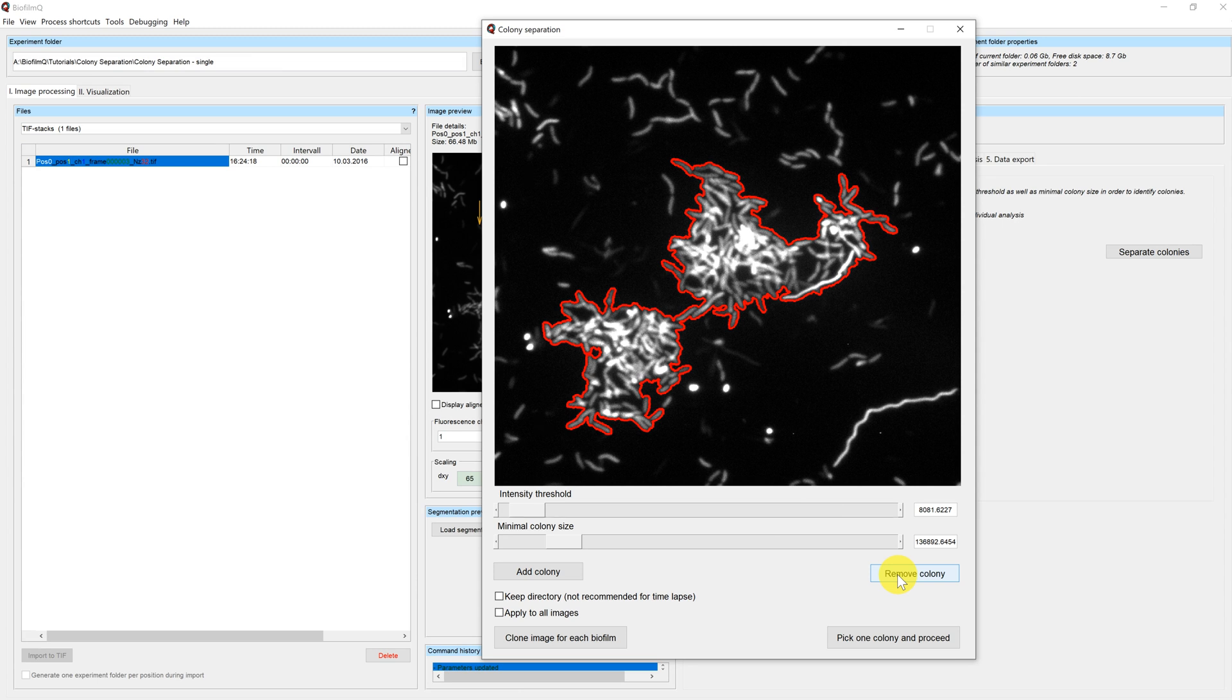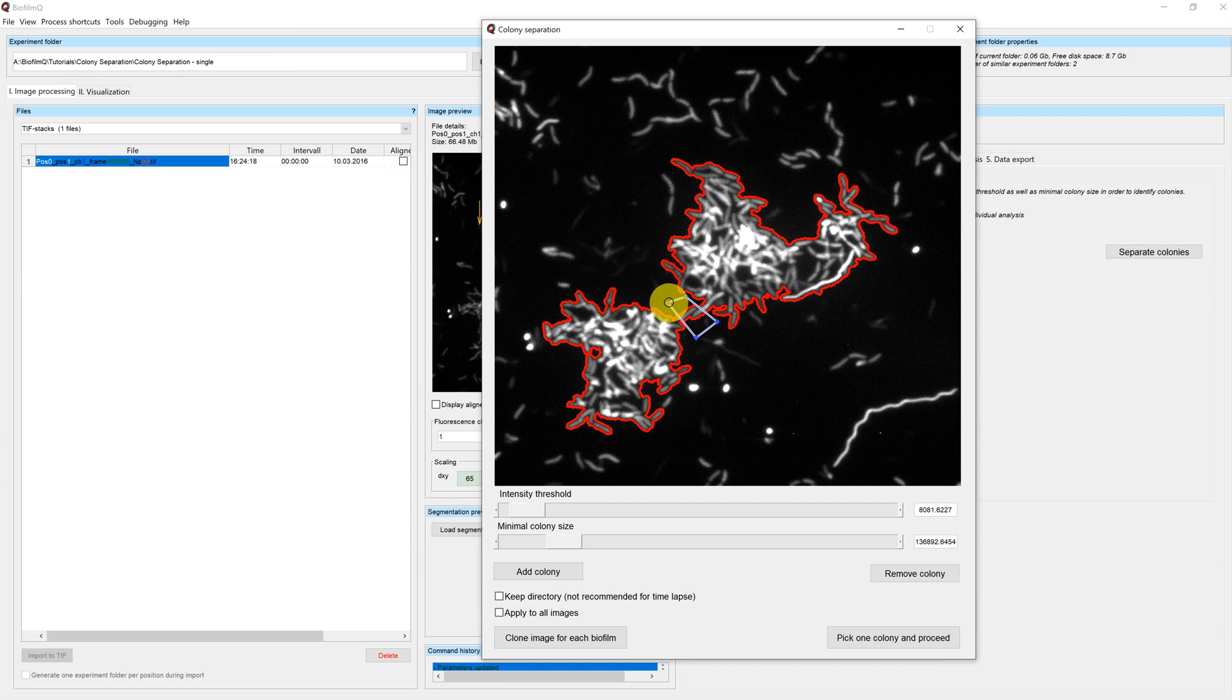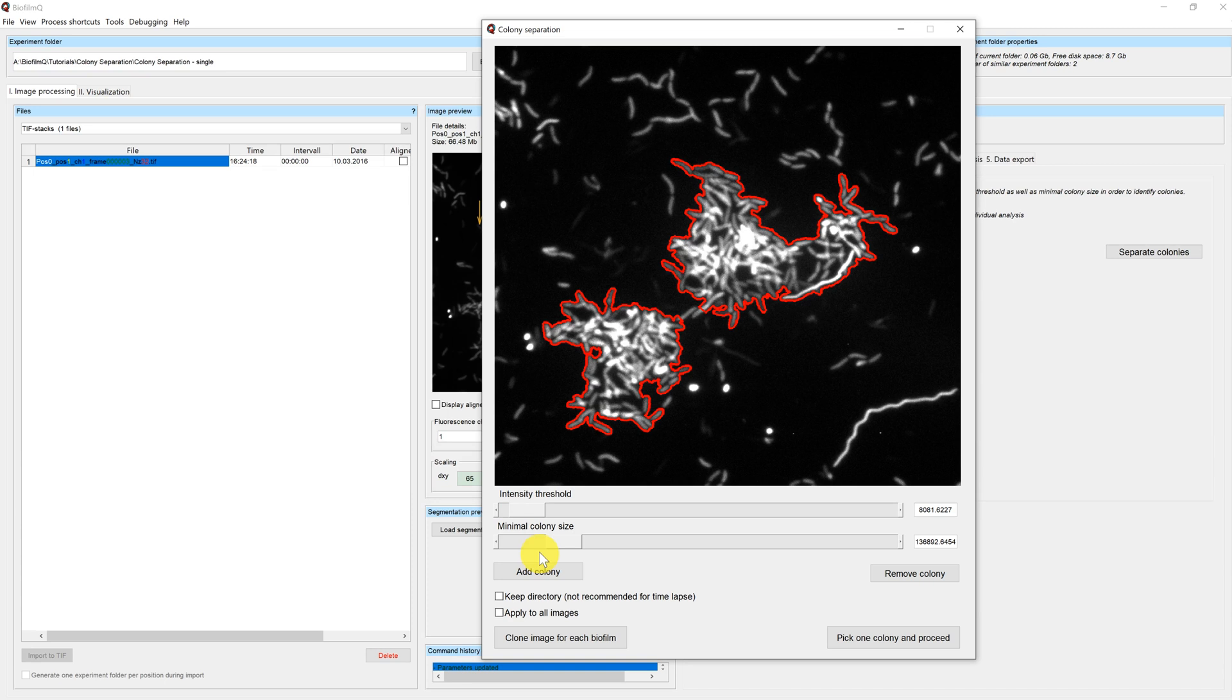We want to remove this area by using the remove colony button. Once you press the button, a crosshair appears and you can select an area you want to remove from the current selection. Double click to apply the settings.